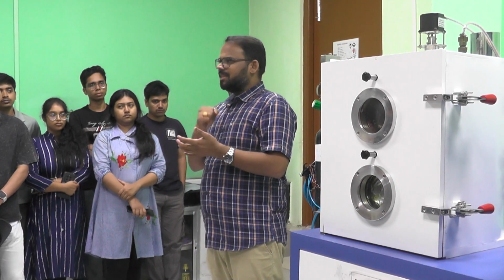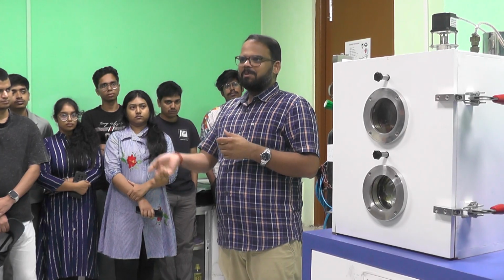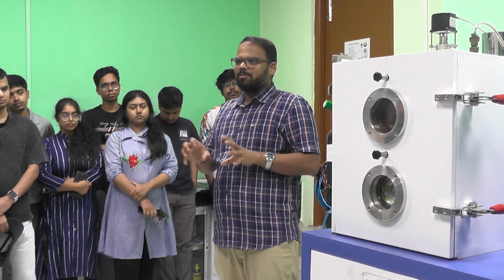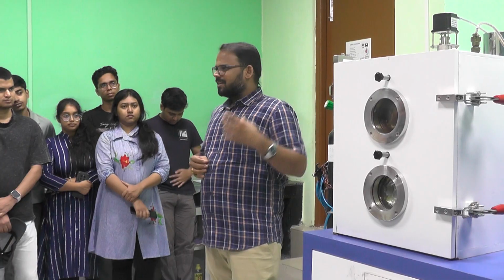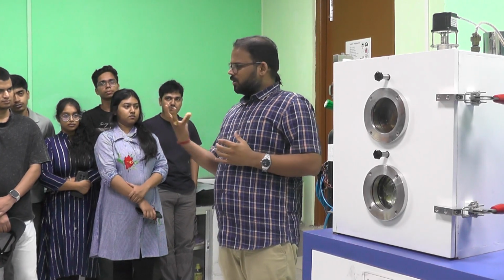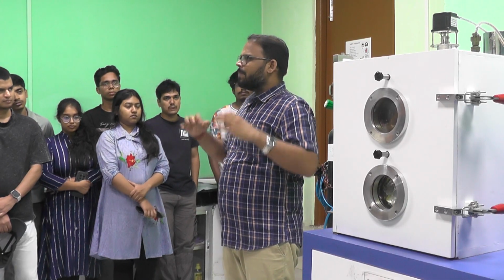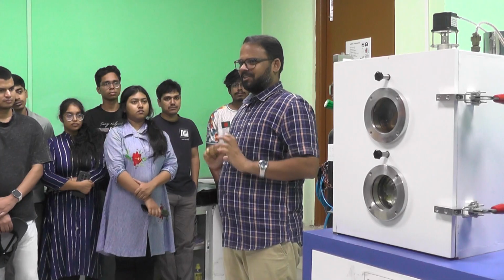The way, for example, I am telling you, we had so many times GST 225, so germanium is 2, antimony is 2, tellurium is 5, so this is the stoichiometry. Some advanced setups are there with 3 cathodes inside. In one you can place germanium, in one you can place antimony, in another tellurium, and you can adjust the power of each.